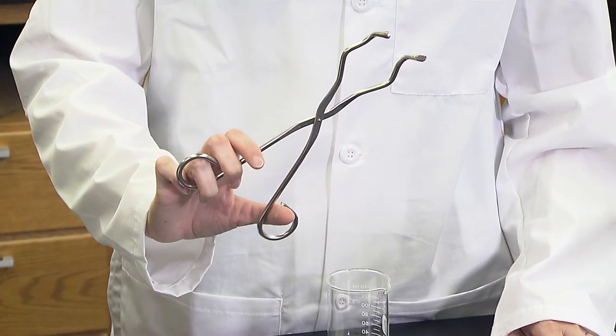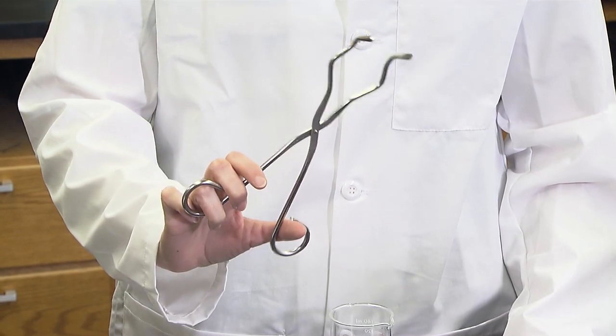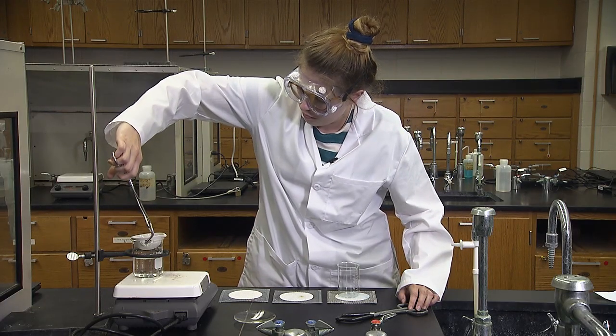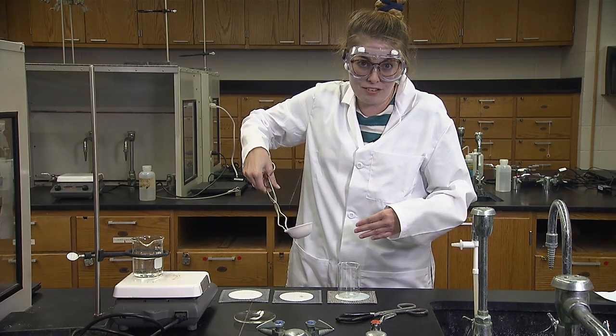When removing the hot evaporating dish, use the crucible tongs found in the general equipment drawer. Again, you place it on the mat to cool.